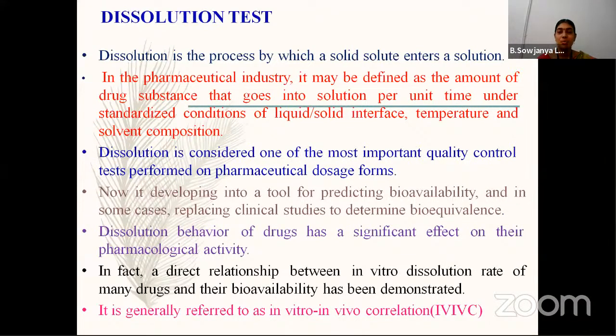So it is one of the most important quality control tests performed on pharmaceutical dosage forms, whether tablet, capsule or suspension. It predicts the bioavailability of the drug.